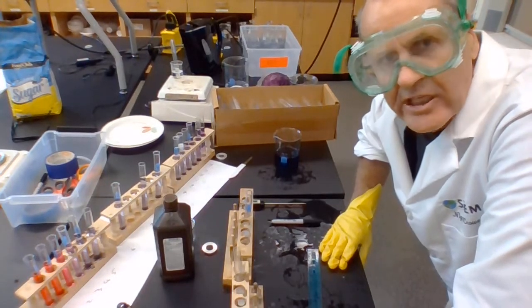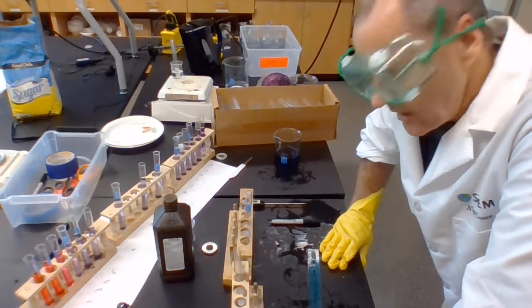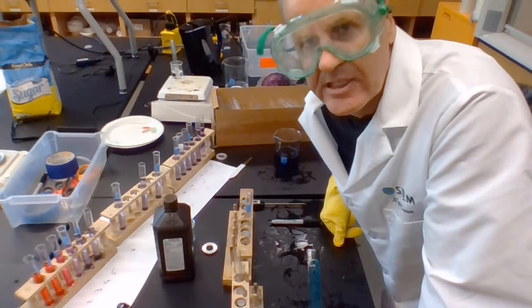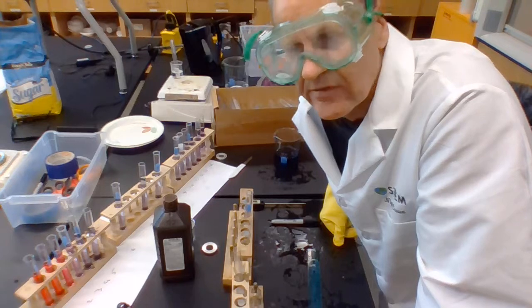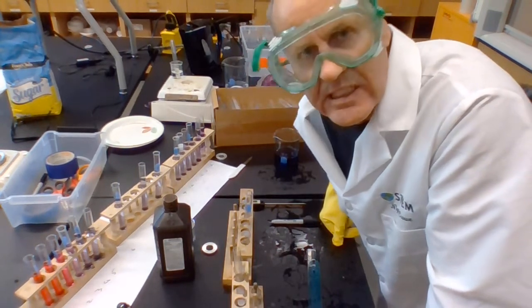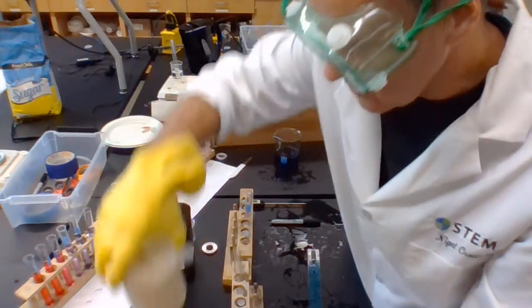Well, hello. We're looking at enzymes today, and the enzyme we're looking at is catalase. I could have used anything as my source of catalase because it's in just about every cell. I could have used potatoes, I've got them here. I could have used liver, but I've instead chosen yeast.